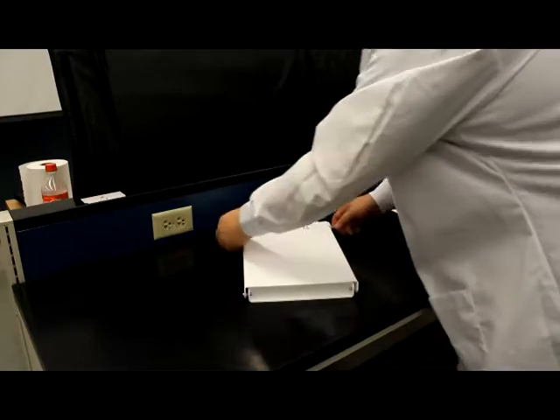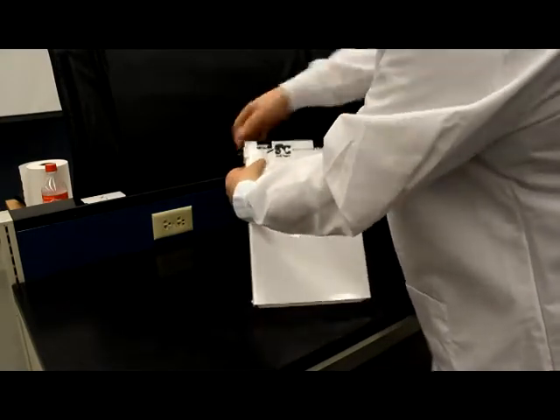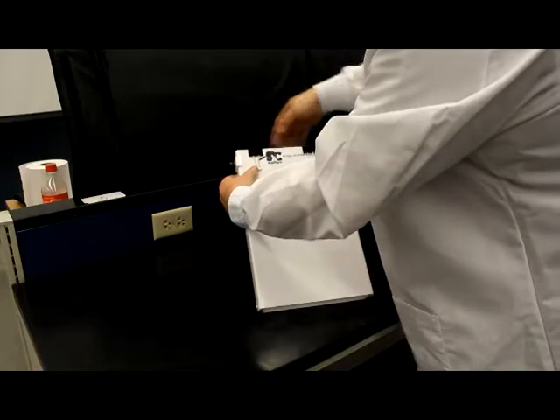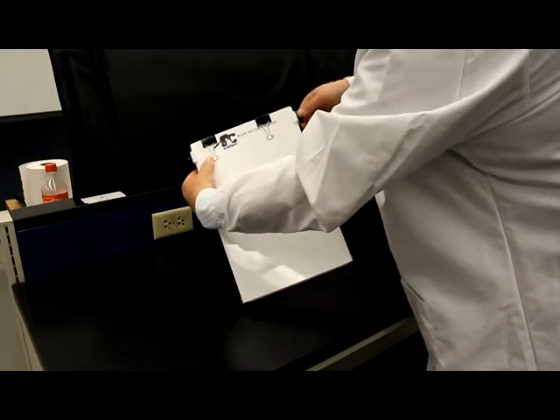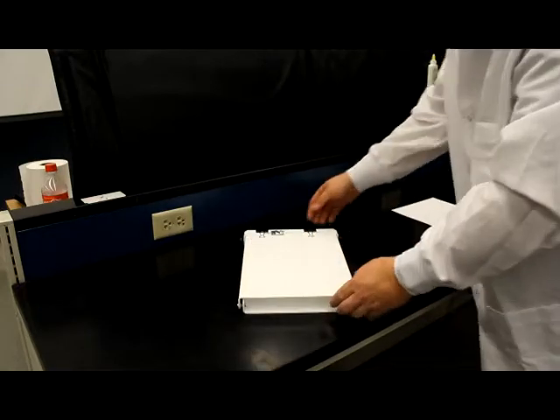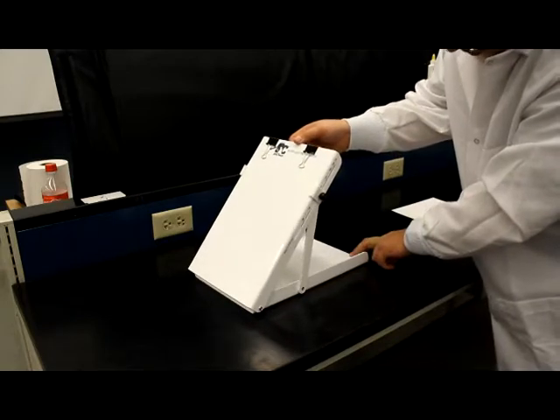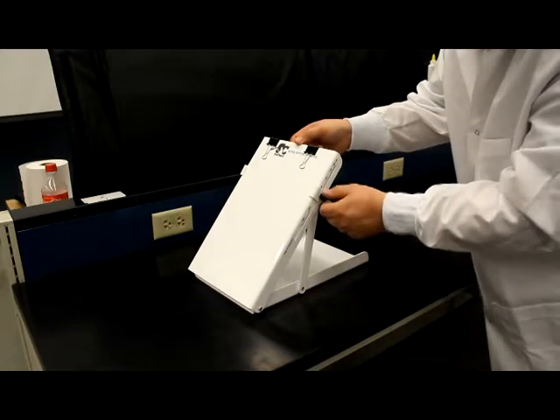As I said, you're going to want to go ahead and turn these counter to each other. So in this one, you're turning it in this direction, and in this one here, you're turning it in this direction. So loosen those up, not so much they fall off. Turn to the side, set the angle that you desire. In this case, 50 degrees.